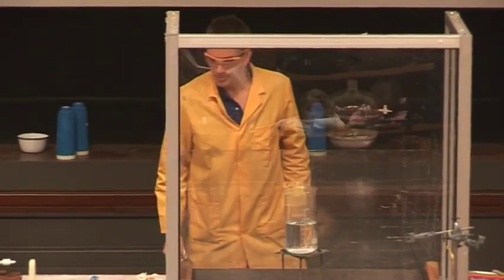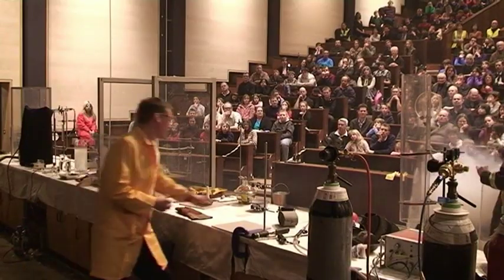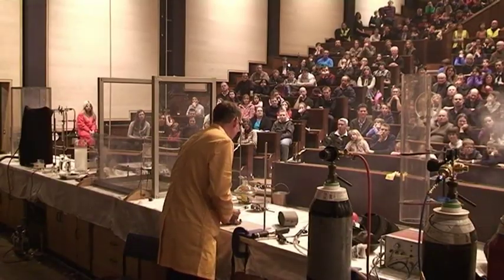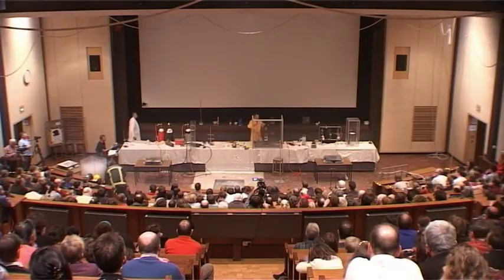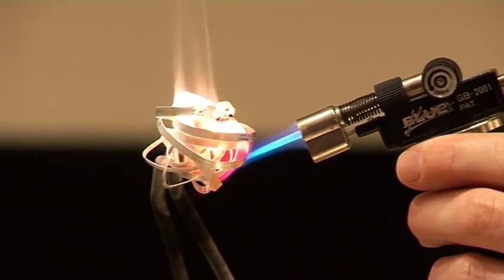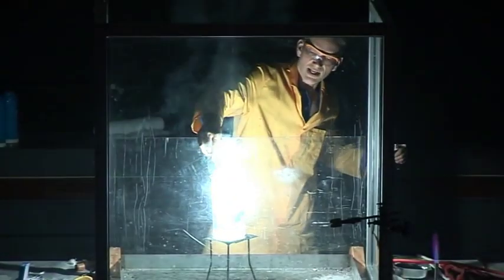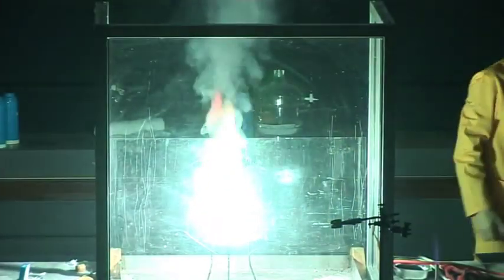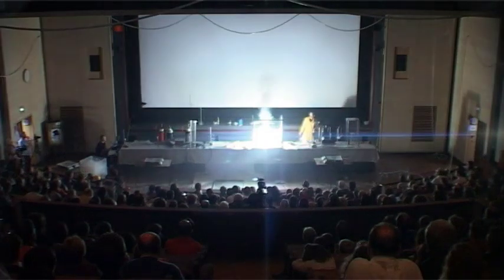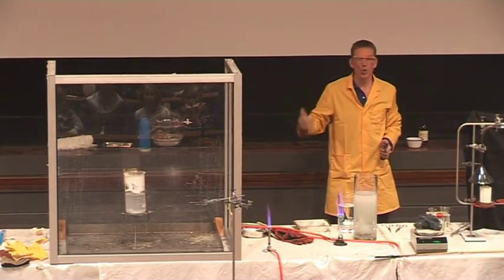What about burning magnesium? So I need to light the magnesium to get it going. Going to get it burning. Okay, and lower it into the steam and into the water. And look how vigorous the reaction is. So even in water, the magnesium, well, it burns in water.